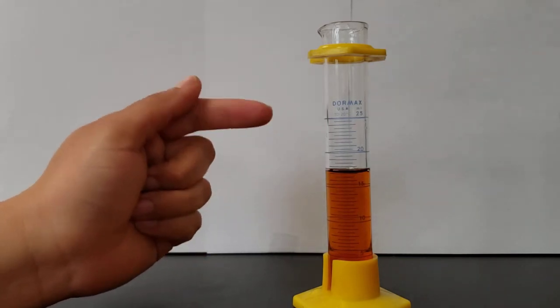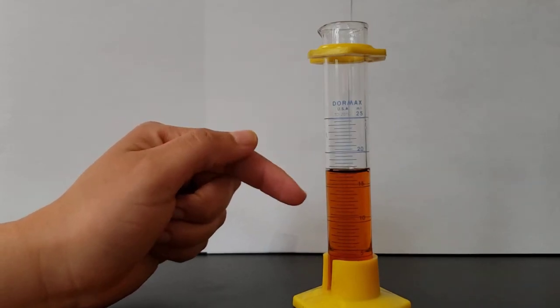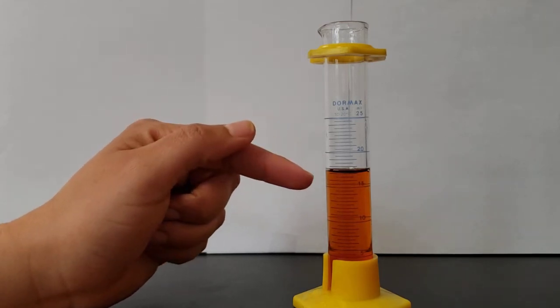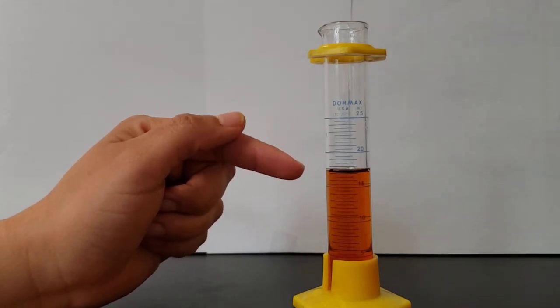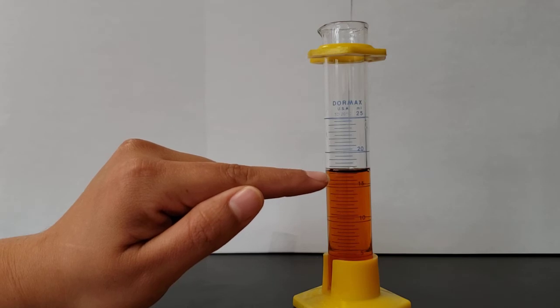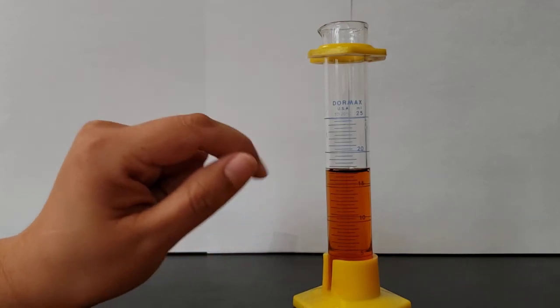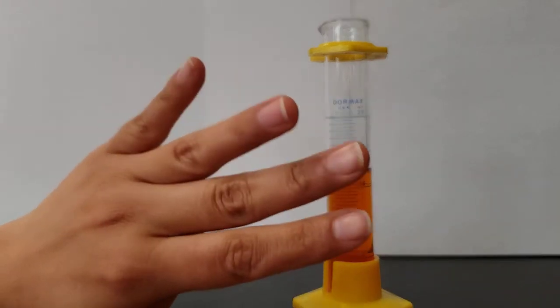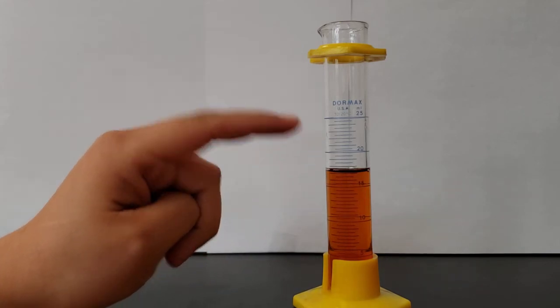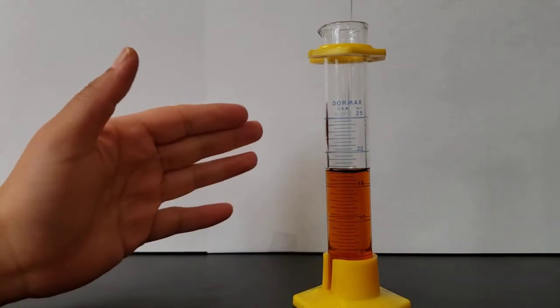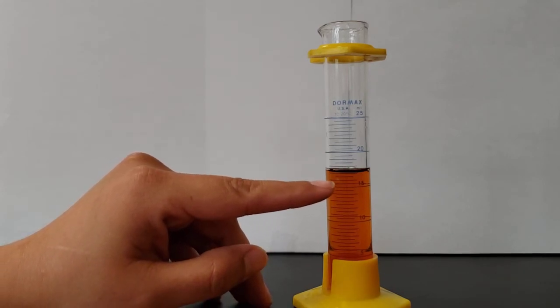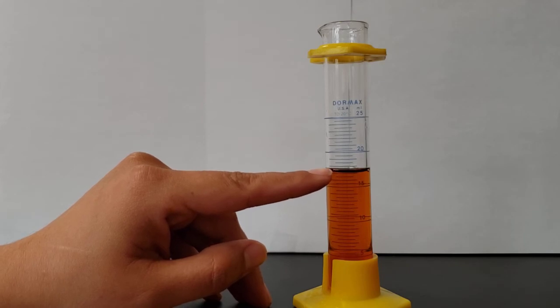All right, so you should have gotten 0.5. So whether we're counting down from 20 or up from 15, we are going to either add or subtract 0.5 every time we go up a line from the number that we started with. So here we started at 15. So this is 15.5, 16, 16.5, 17. So we said that the bottom of the curve was 4 lines above 15, 4 times 0.5 is 2. So 15 plus 2 is 17. And it's the same amount that we got if we just counted by 0.5 from 15. So again, 15, 15.5, 16, 16.5, 17.